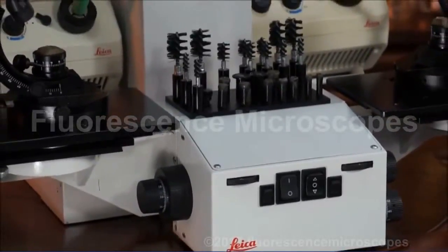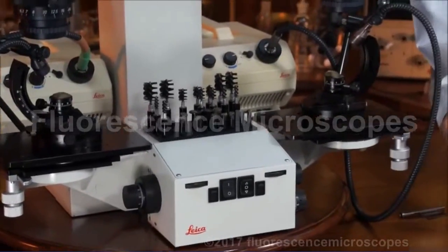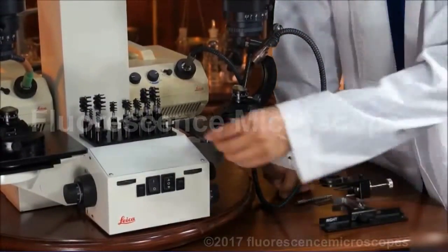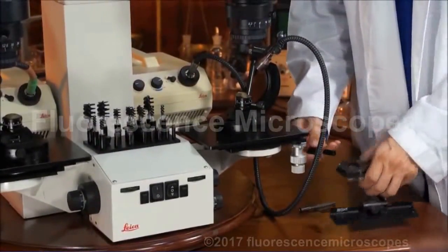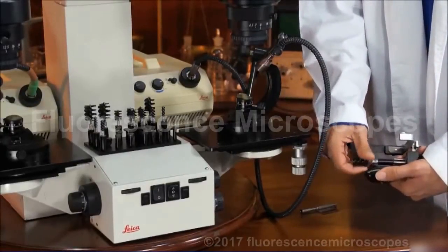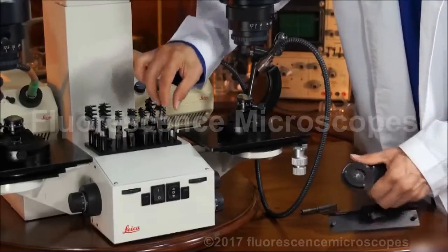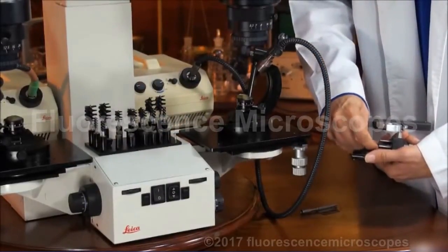We do have some other bullet holders — these can be removed and this one inserted. You've got the brushes, and you can go to these. That's for holding the bullet cartridges. The bullet holders themselves screw on.